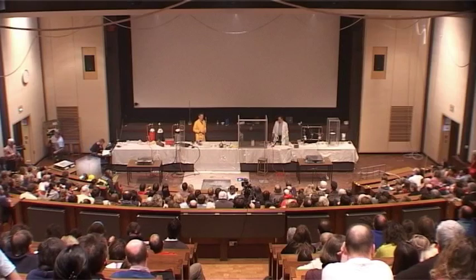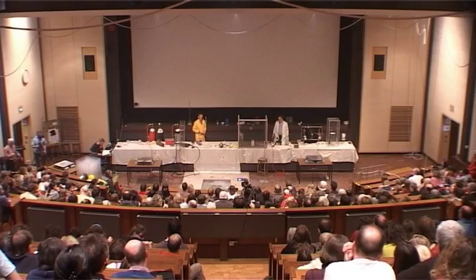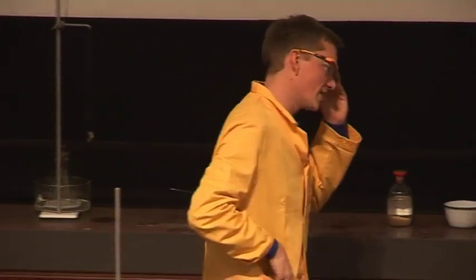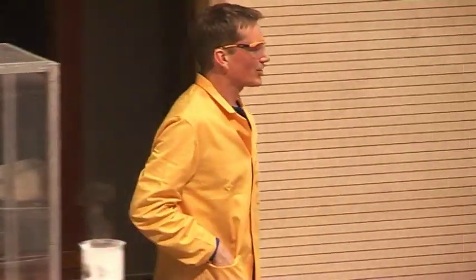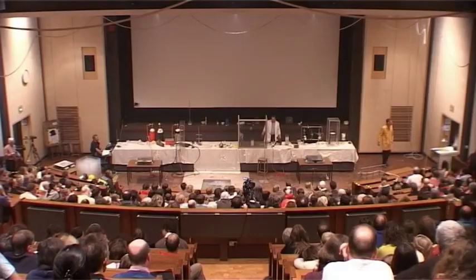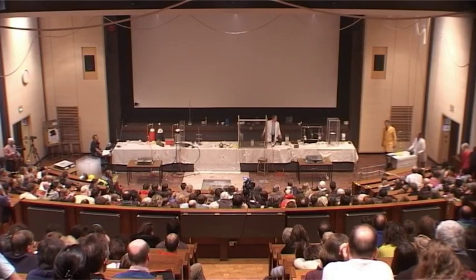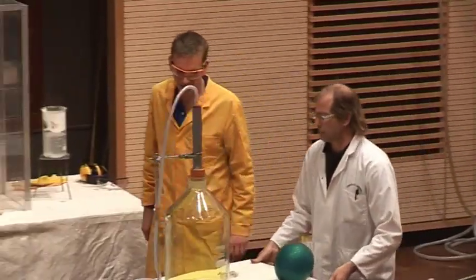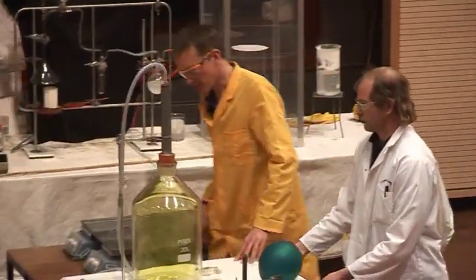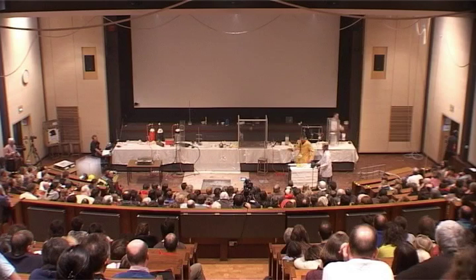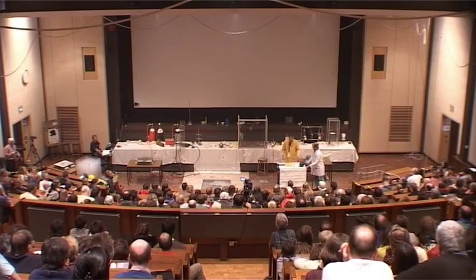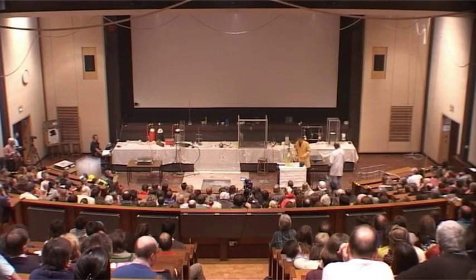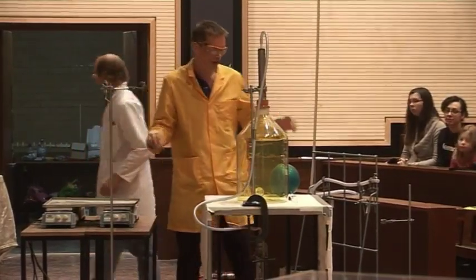Do things have to have oxygen in order to burn? Can we burn things without using any oxygen? Chris has filled up this apparatus here with another gas, chlorine. Now, chlorine is very poisonous, so we've had to take precautions here to absorb any chlorine that's coming out through the apparatus. But I wanted to show a reaction now with no oxygen whatsoever.